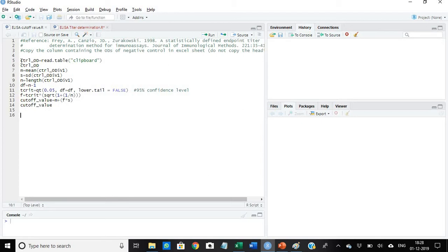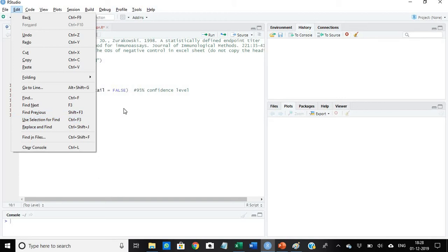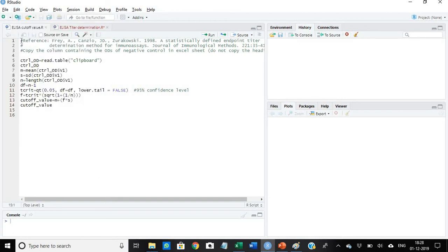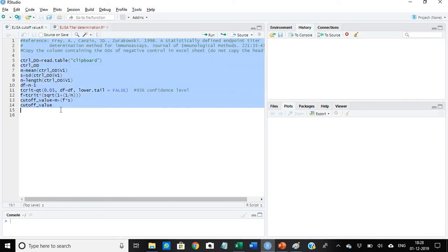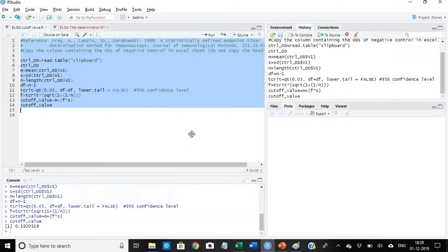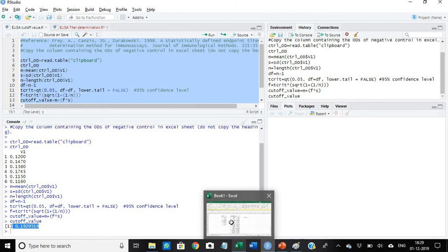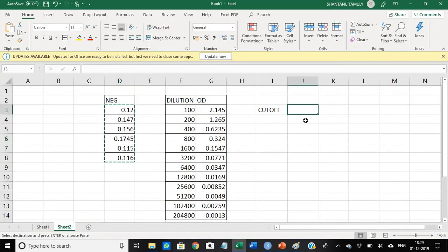I've copied the six values and then I'll have to select all the commands. I can just select it by my mouse pointer and then click here run. So when I click here run, you can just drag it. Here at this point I got the cutoff value. My cutoff value comes out to be 0.192.